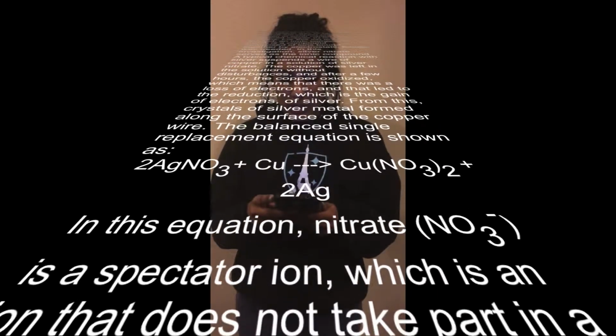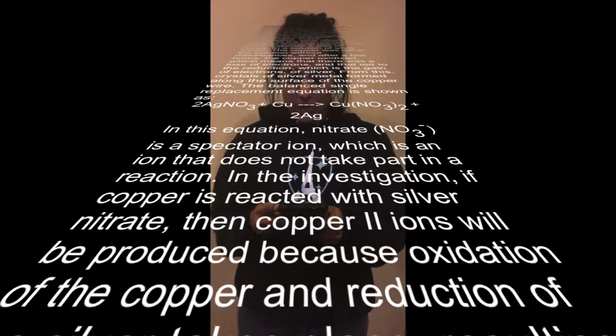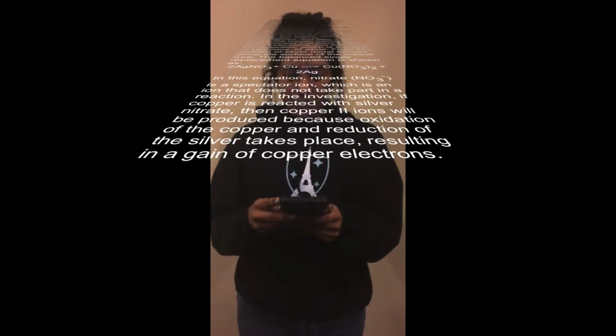The balanced single replacement equation is shown as 2AgNO3 plus Cu yields Cu(NO3)2 plus 2Ag. In this equation, nitrate is a spectator ion, which is an ion that does not take part in a reaction. In the investigation, if copper is reacted with silver nitrate, then copper 2 ions will be produced because oxidation of the copper and reduction of the silver takes place, resulting in a gain of copper electrons.